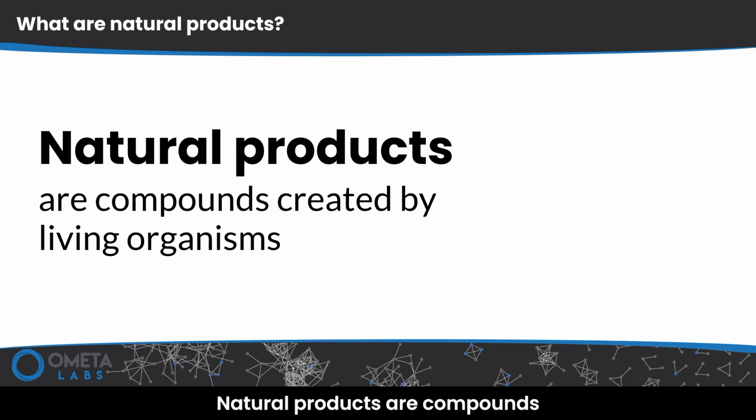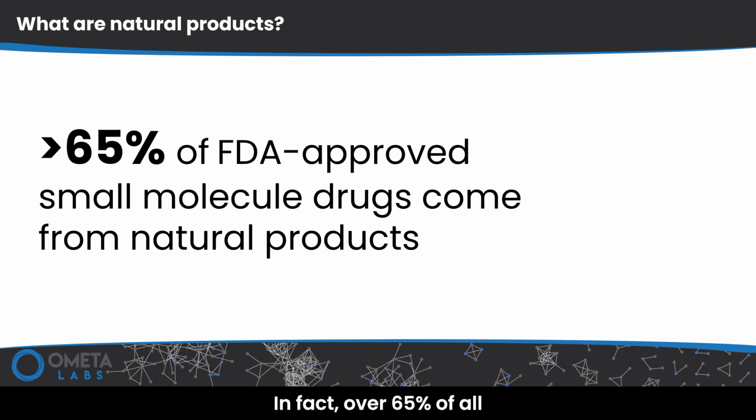Natural products are compounds created by living organisms. These compounds often possess unique chemical structures and potent biological activities, making them a rich source of inspiration for drug discovery. In fact, over 65% of all FDA-approved small molecule drugs come from natural products.